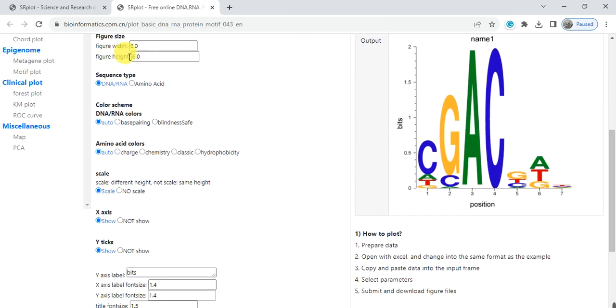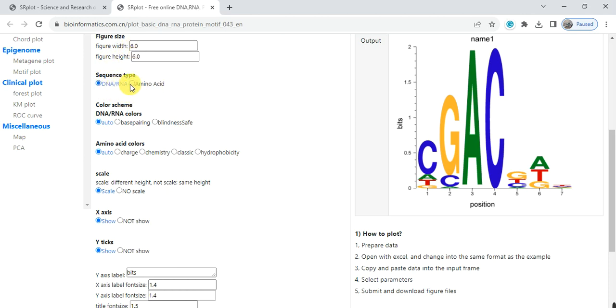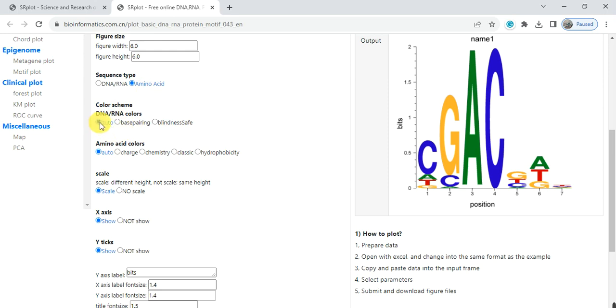Here you can select the figure width and height. Here is whether it is DNA, RNA, or amino acid. We have amino acid so click here. Here are the color options, I select auto. You can change into base pairing or blind.